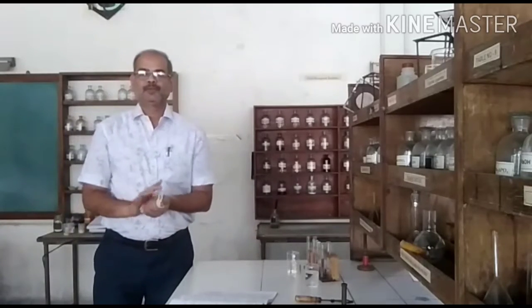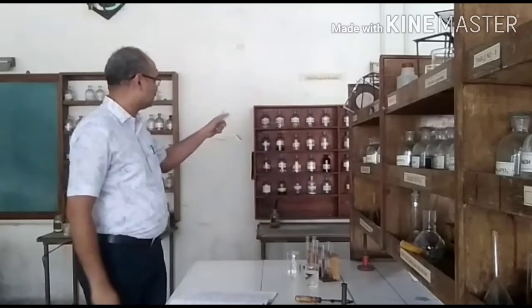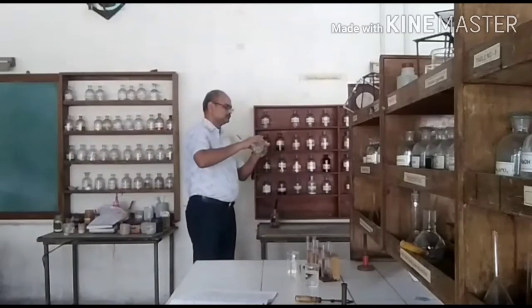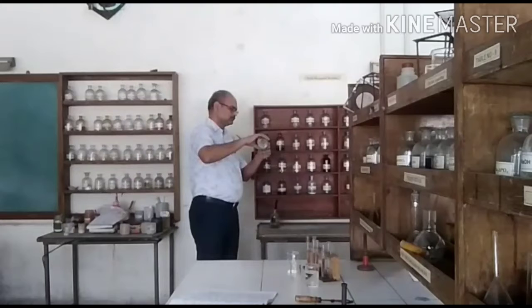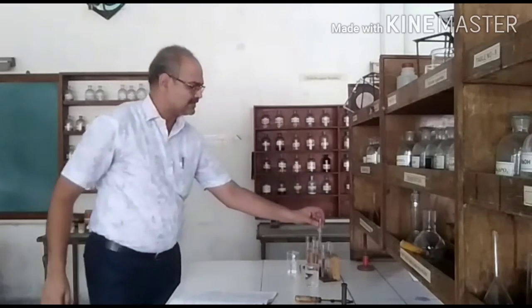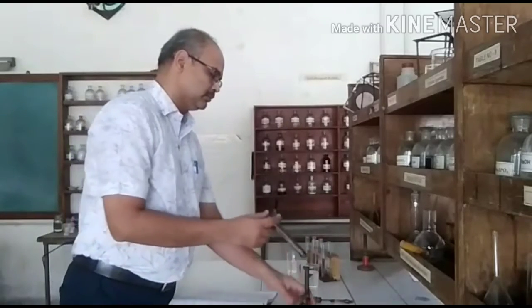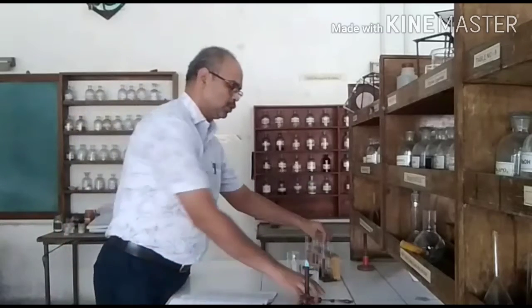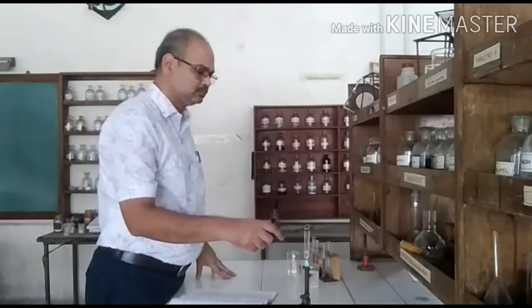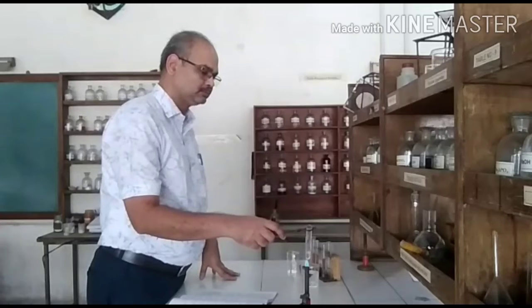What I will do is, in a clean test tube, first I will take ammonium acetate. Ammonium acetate is again on the side rack. I want hot ammonium acetate. This is cold ammonium acetate. So I will just put it on the burner. Hold the test tube containing ammonium acetate in the test tube holder, and just make this ammonium acetate hot.